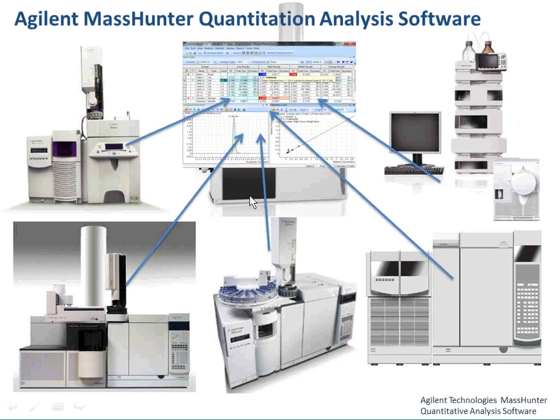I'd like to welcome you to a discussion of features that support the continuing calibration workflow. The continuing calibration workflow purpose is to reuse the calibration standards. In other words, keep analyzing samples, just re-verify your existing, called initial calibration, with a CC injection. Once that continuing cal CC injection passes its acceptance criteria, then you're back to running samples.